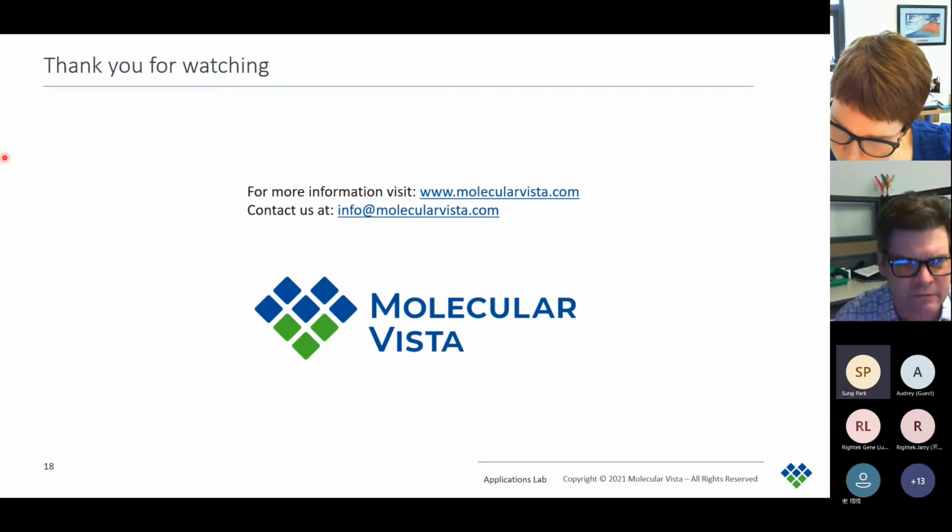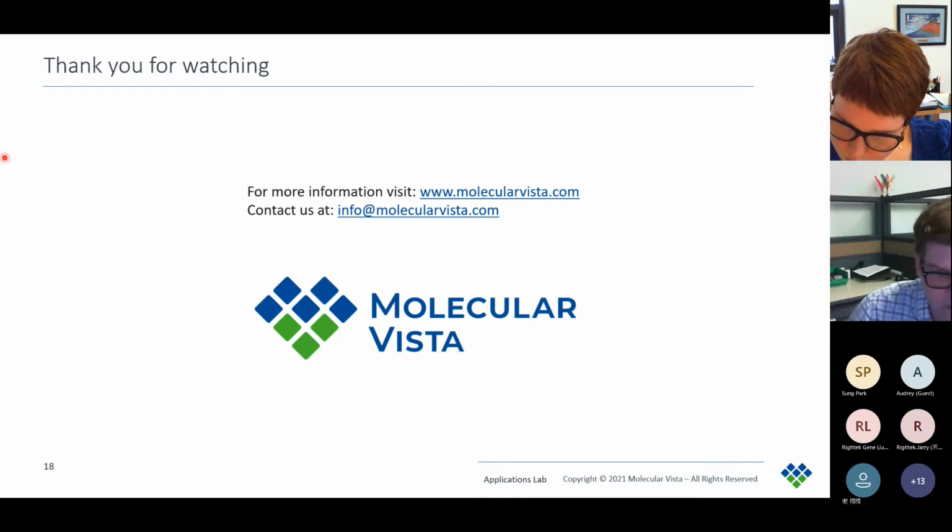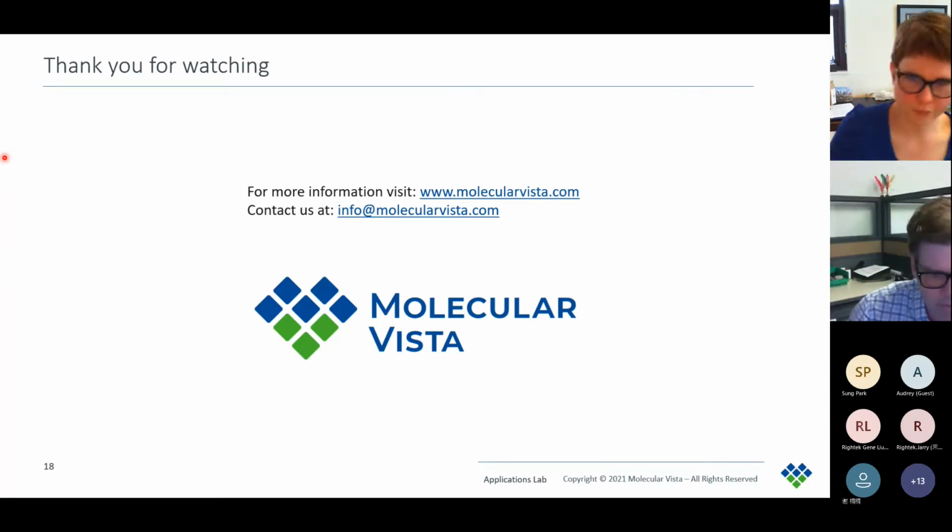Oh, I see. Great. Yeah, these don't update on my screen as fast as yours, so I'm glad you're pointing these out. How do you clean the sample after polishing to ensure there's no residue from polishing powders? Ultrasonic bath required. Yes. Is that how you would do it?